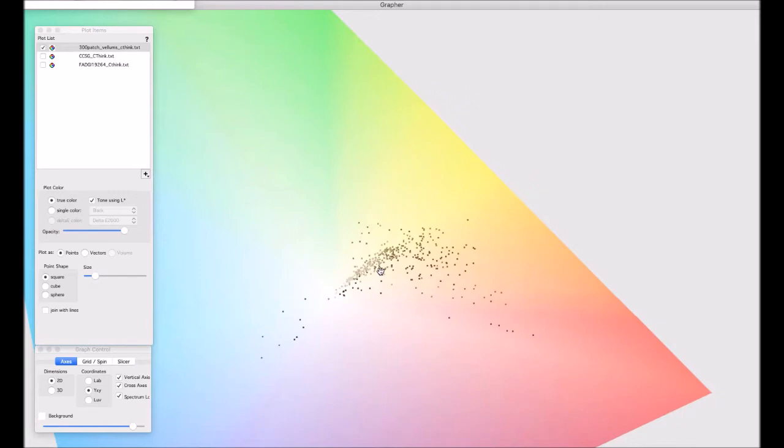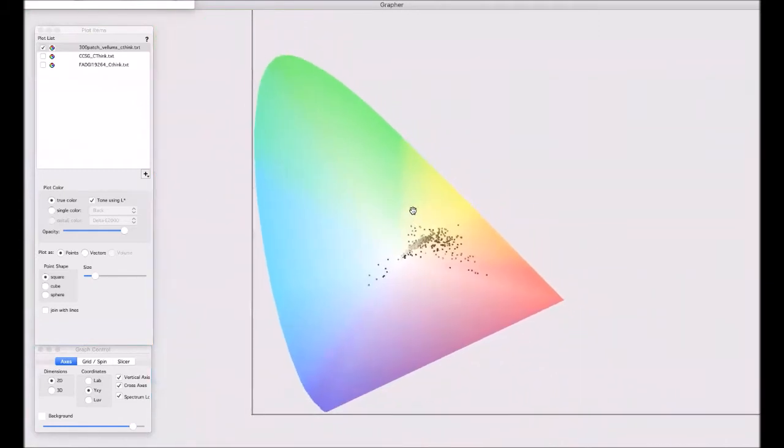What you don't see here is how light or dark they are, even though they're rendered as light and dark, you don't get a quantitative sense of that. So I'm going to zoom back out. This is meant to give you a benchmark of how you typically see these rendered in publications. But now I'm going to switch to this LAB mode. It's still a two-dimensional sense, and the next step after this is three-dimensional. By the way, we're still looking at the actual measured ones. So I'm going to switch to LAB.